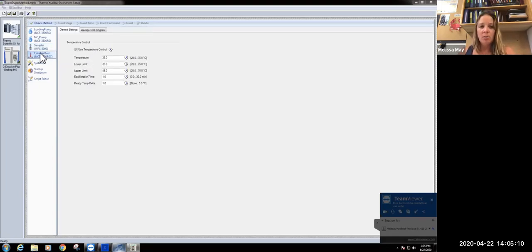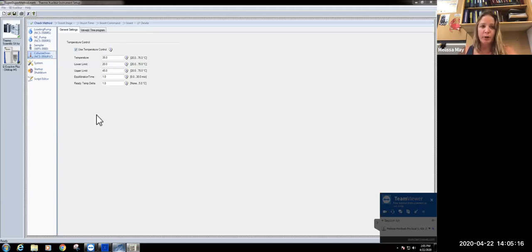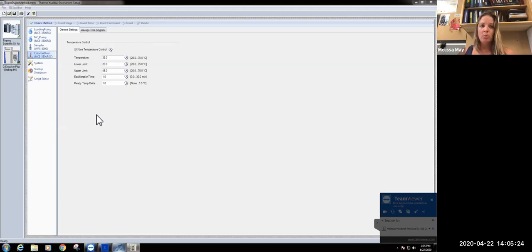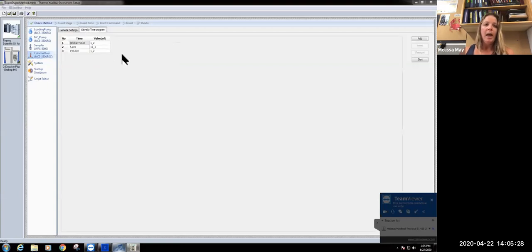In terms of our column oven, we've gone over this before, but we maintain the temperature at 35 degrees. This is recommended for the particular column that we use. Because it's longer, you need to heat them. That comes with the manufacturer's instructions. So if you're changing the column, you may want to hold the temperature a little bit lower, but that's something to verify.